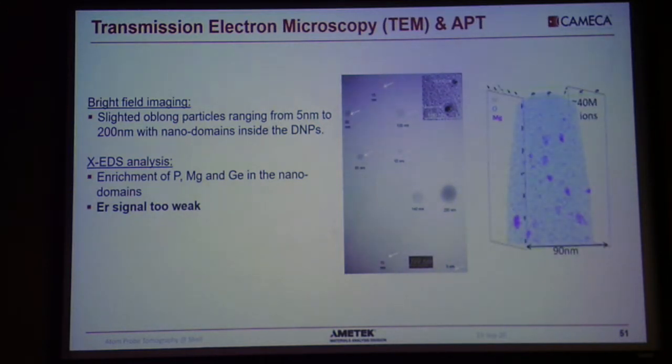So this is where it's important for you to understand that when you do atom probe, part of it is specimen preparation, part of it is acquisition of the data, and there's another 50% remaining. This 50% remaining is the data processing. Lots of the techniques that you are using, once you've done your experiment, it's pretty much 10% more of data processing and you're done. In atom probe, 50% of it is data processing, and this is where we're going to use the data processing power to be able to find this erbium.